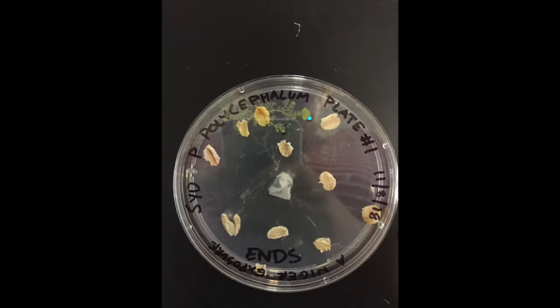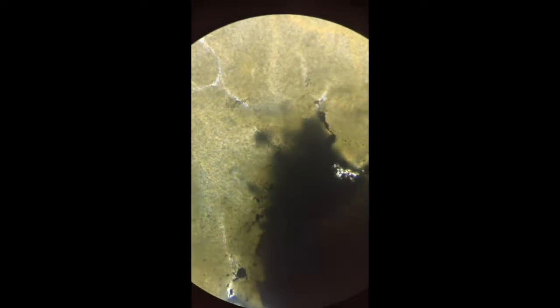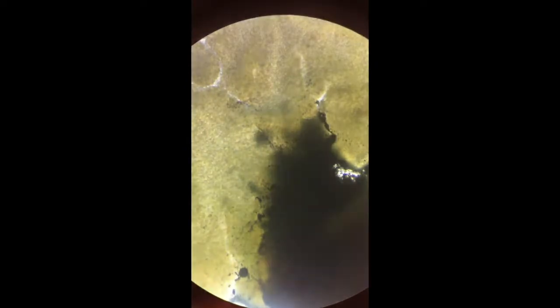And on the right, at the rightmost point of Aniger, we can see the same thing. This time the nutrient flows are flowing away, but that's pretty typical with the pulsing of the flows going back and forth.